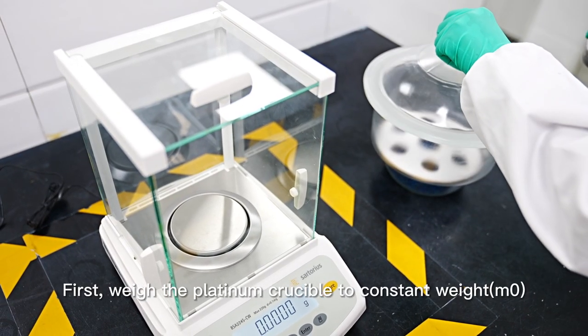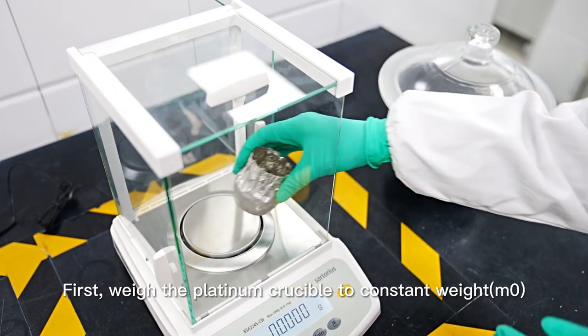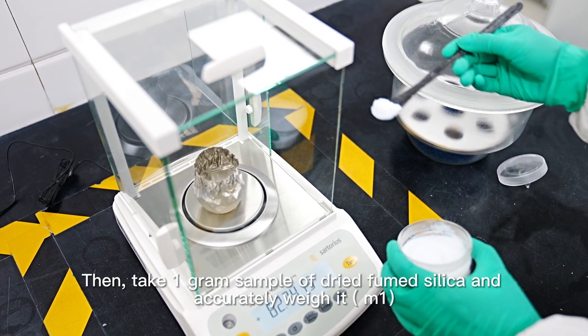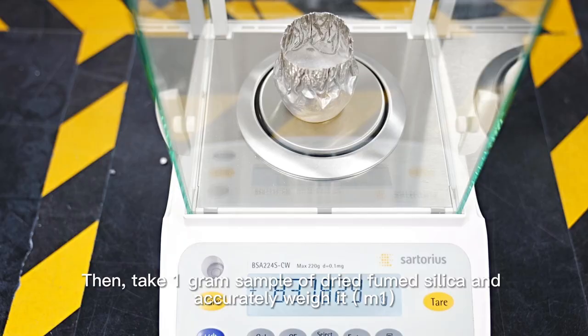First, weigh the platinum crucible to constant weight M0. Then, take a 1g sample of dried fumed silica and accurately weigh it.